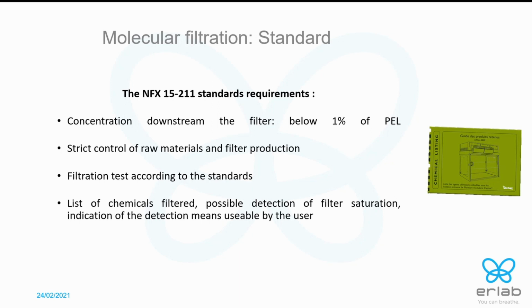Also the way we test the efficiency and the capacity of the filter is rated by standard. And the standard requires the manufacturer to give the list of the chemicals filtered and the capacity of the filter.